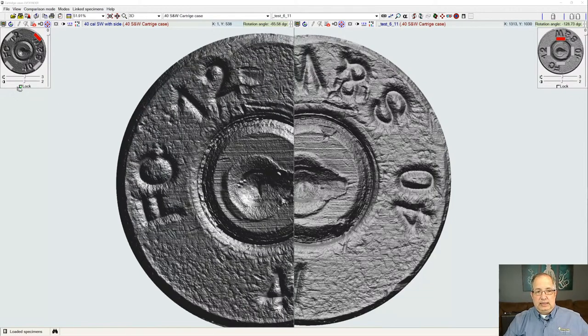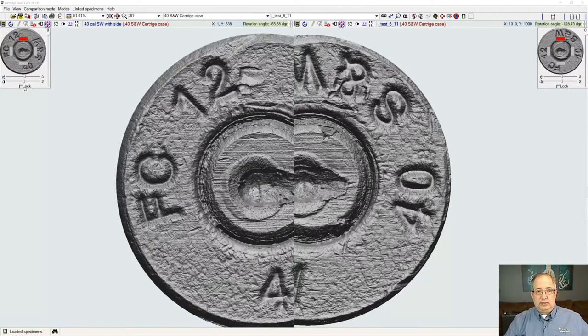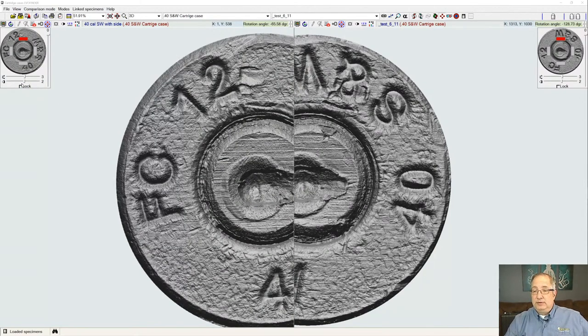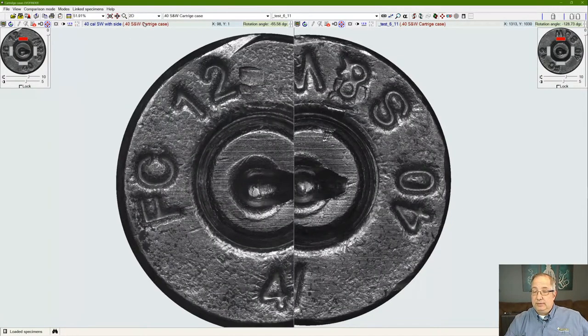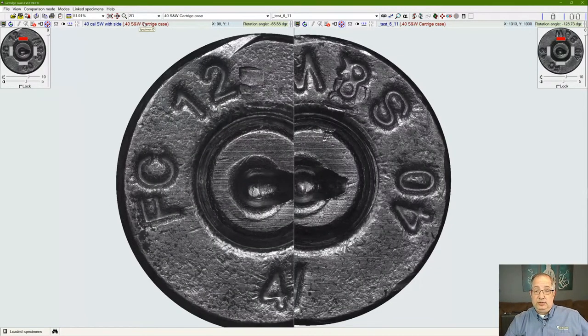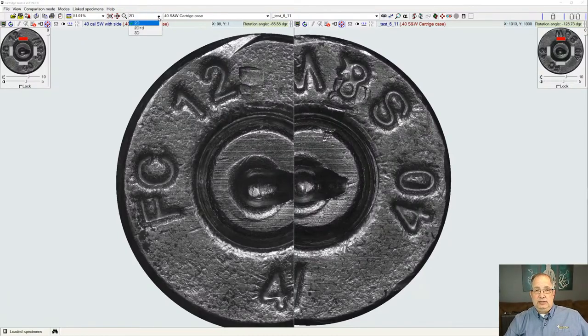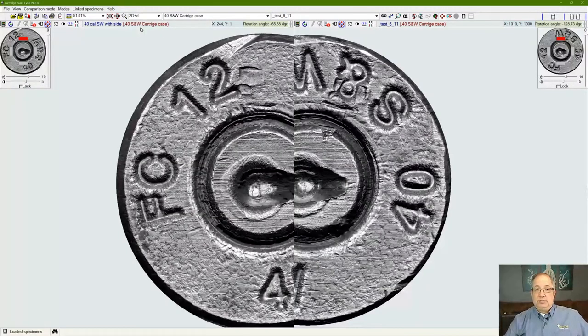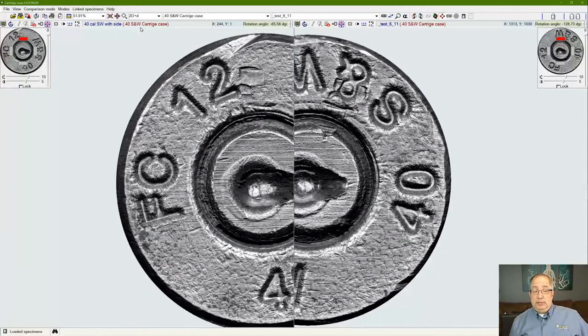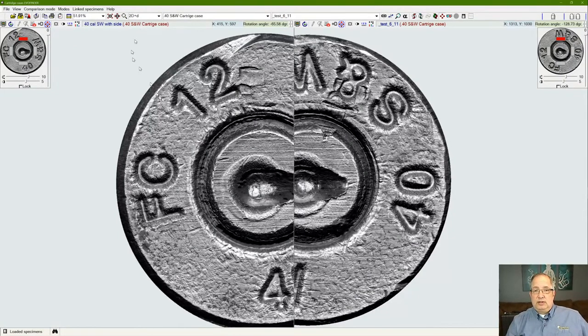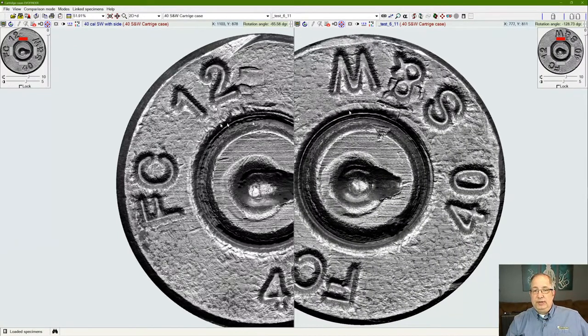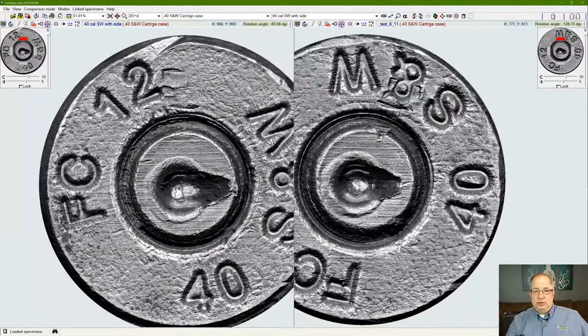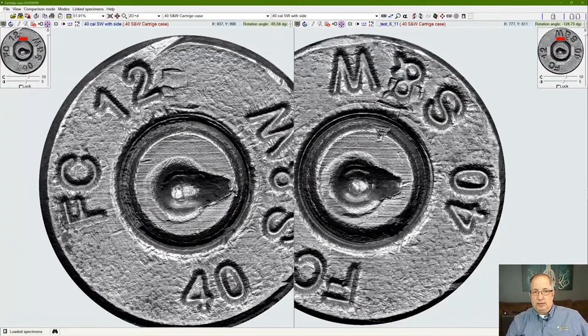Right now we're looking at these samples in a three-dimensional model. We do have two other modes. The 3D allows us that light control. We can also view this as a flat image, which is a 2D grayscale image. Then we can lay that 2D over the 3D model and give us what they call a 2D plus D model, which is a third contrasting or viewing mode to allow us different ways to look at the sample we're imaging.